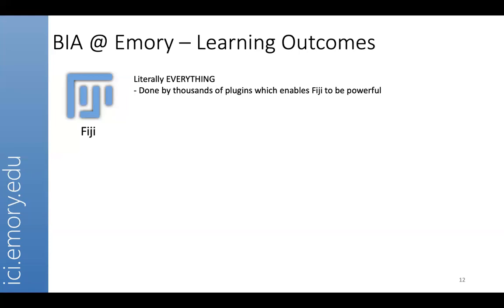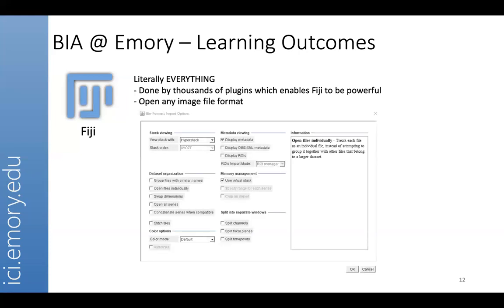So Fiji as a backbone is like that coffee machine, and each of these plugins is like that pod that goes in and gives you the coffee that you want to drink. So in a nutshell, using Fiji, you'll be drinking a ton of Java, and pun intended, Fiji is based on Java, and hence this corny joke of Java really fits in.